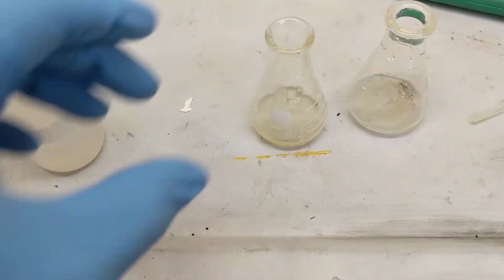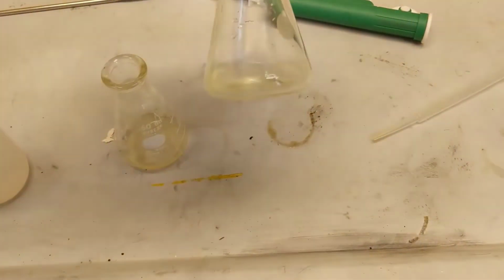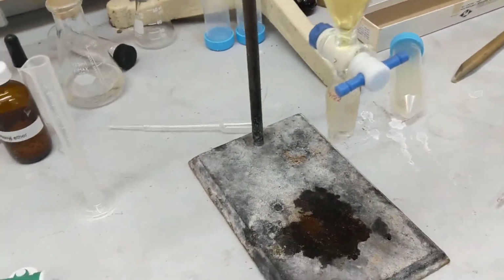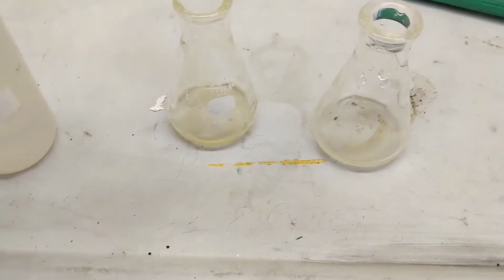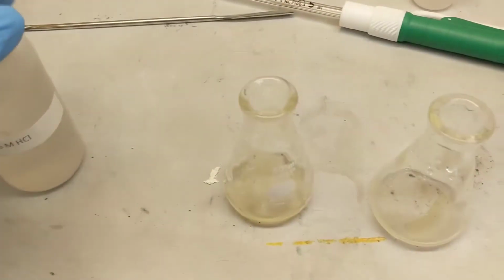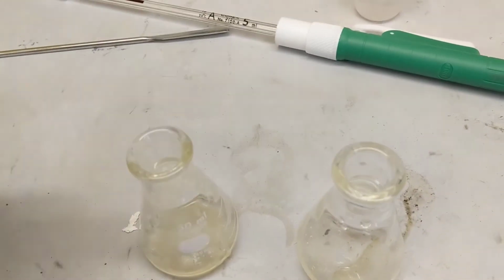Alright guys, these are the two extractions. This is the first NaOH extraction, second NaOH extraction. You can see my ether is still sitting in there. I'm just going to cap it, make sure nothing evaporates off, okay? So now we're going to check these for impurities. We're going to do this by adding acid, 6 molar hydrochloric acid to be specific, to each, and see if precipitates form.